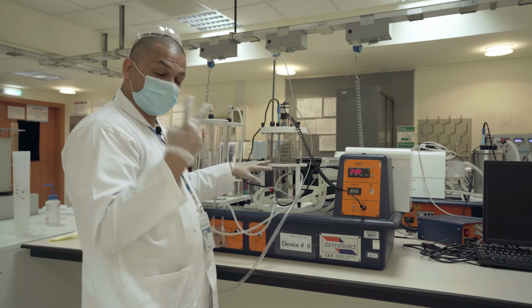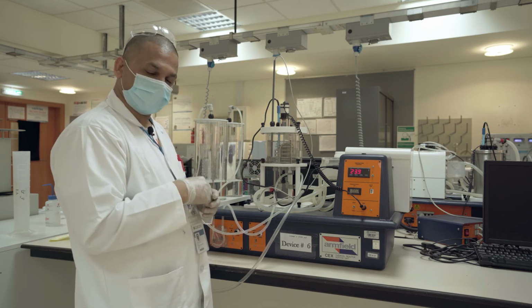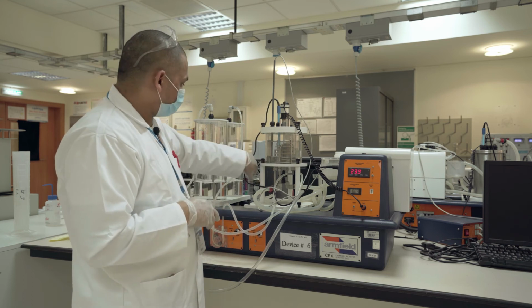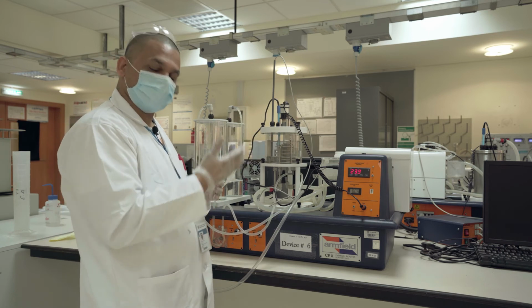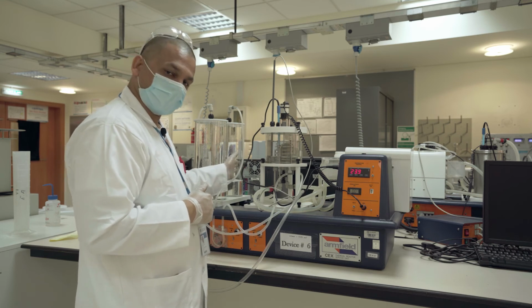So that will help you to find the two unknowns. Then you want to find out maybe the other things, E naught, EA and A naught. For that, now these two feeds, one time allow them to react and reach steady state at room temperature, then heat them.